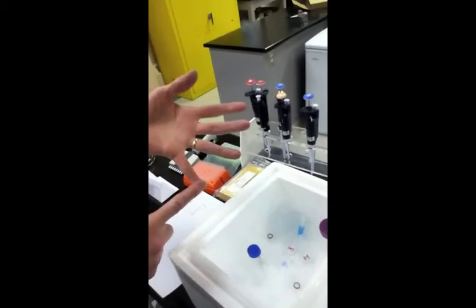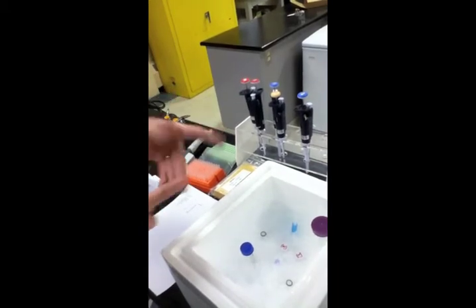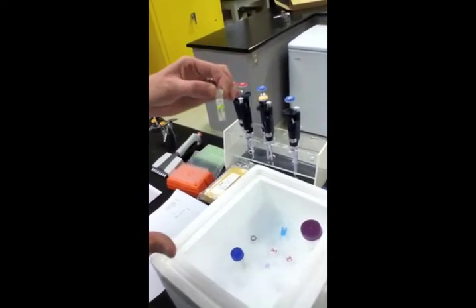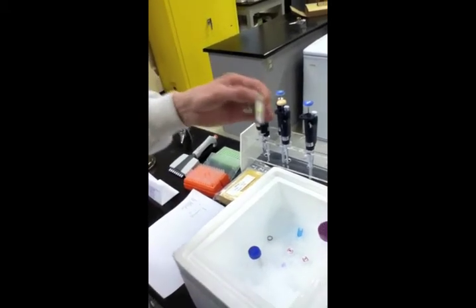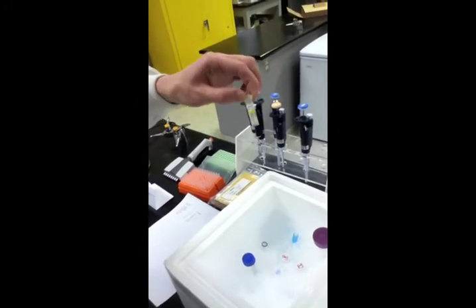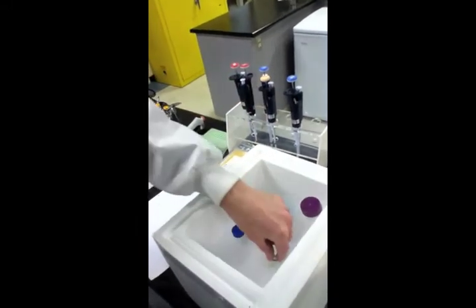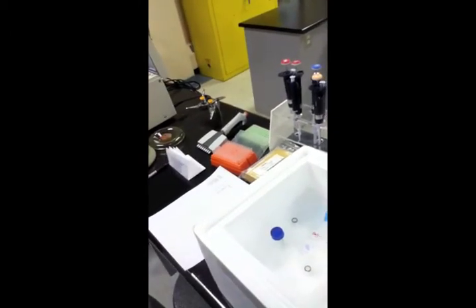So we've got buffer, we've got enzyme, we've got primers. We need one more thing to build DNA, and that's the deoxynucleotides. They come in a little test tube, and we can buy them. These are dATP, dCTP, dGTP, and dTTP, all four nucleotides in a mixture. And of course, these are triphosphates, because you need the triphosphate in order to catalyze this reaction. Remember, that drives the energy that's required to synthesize a polynucleotide chain.